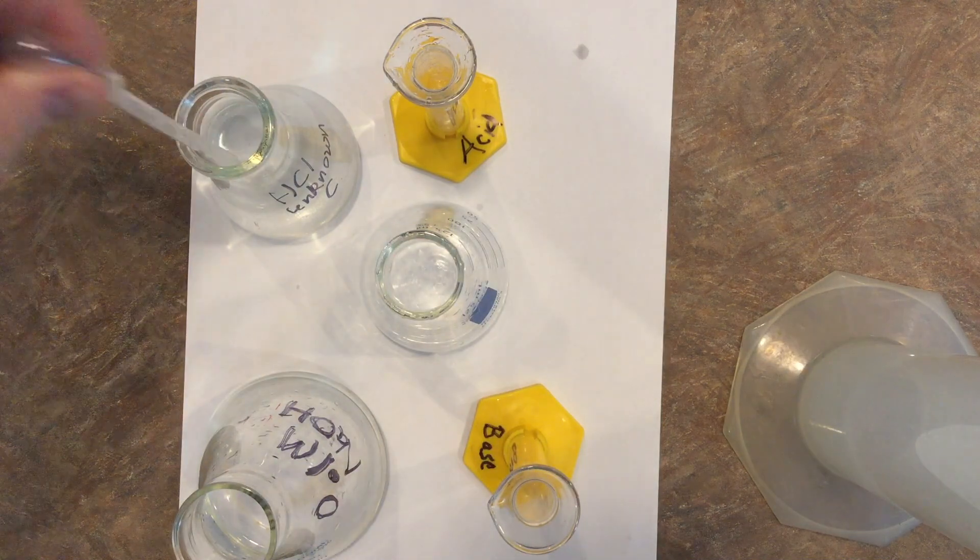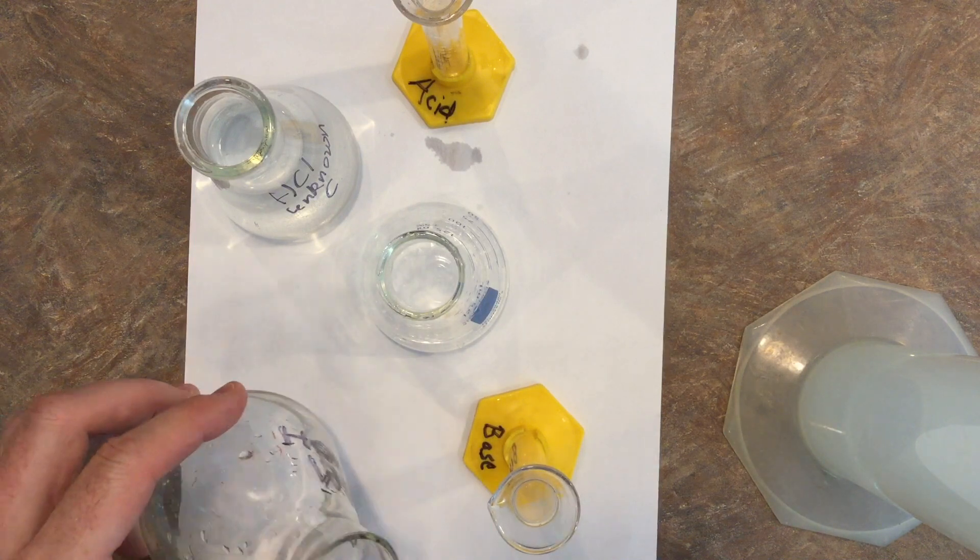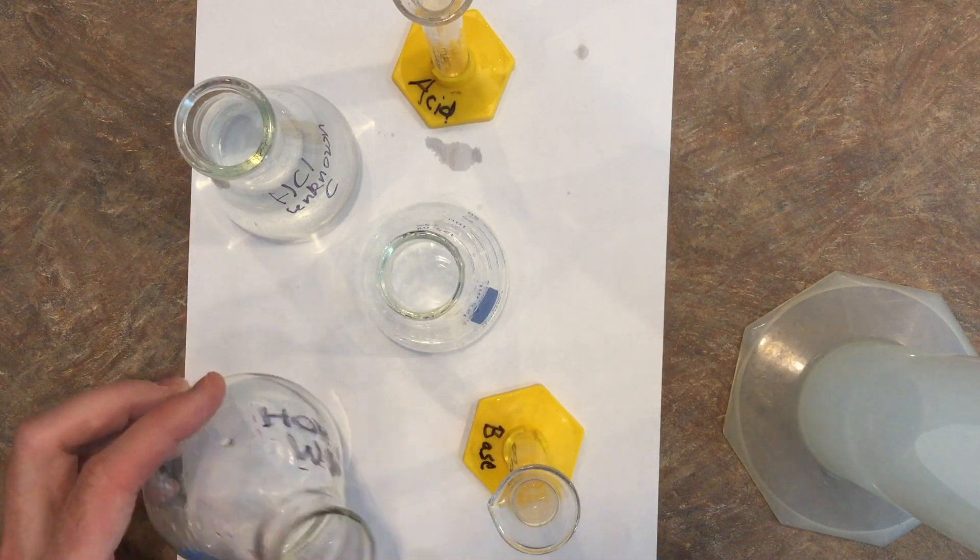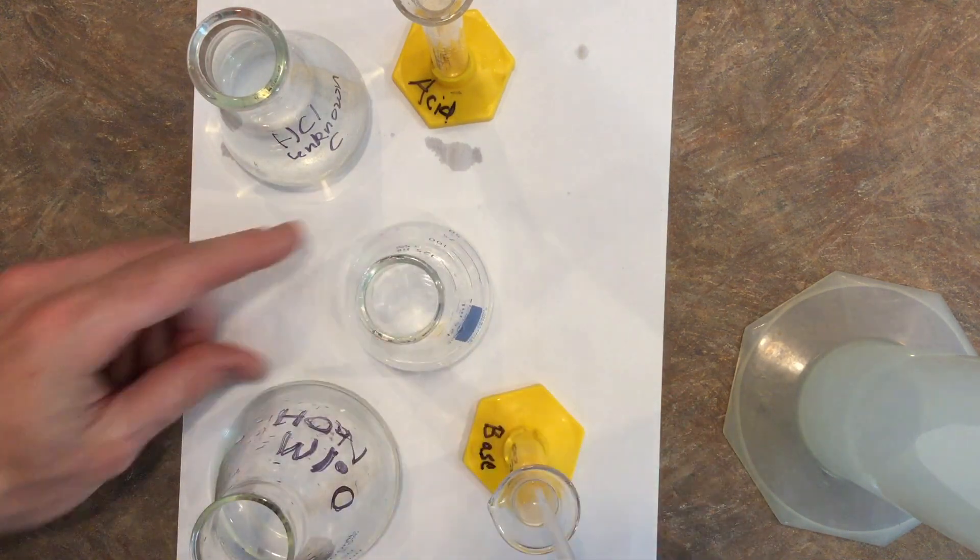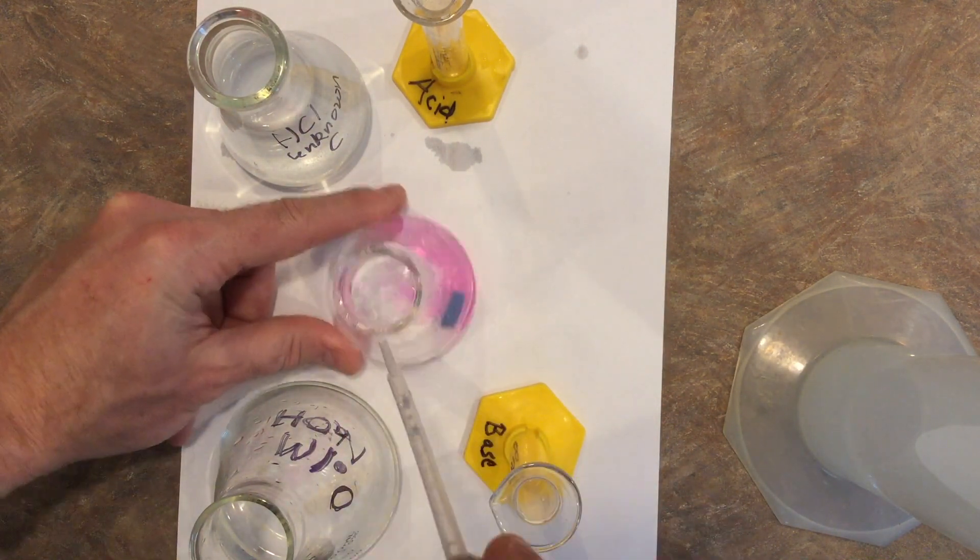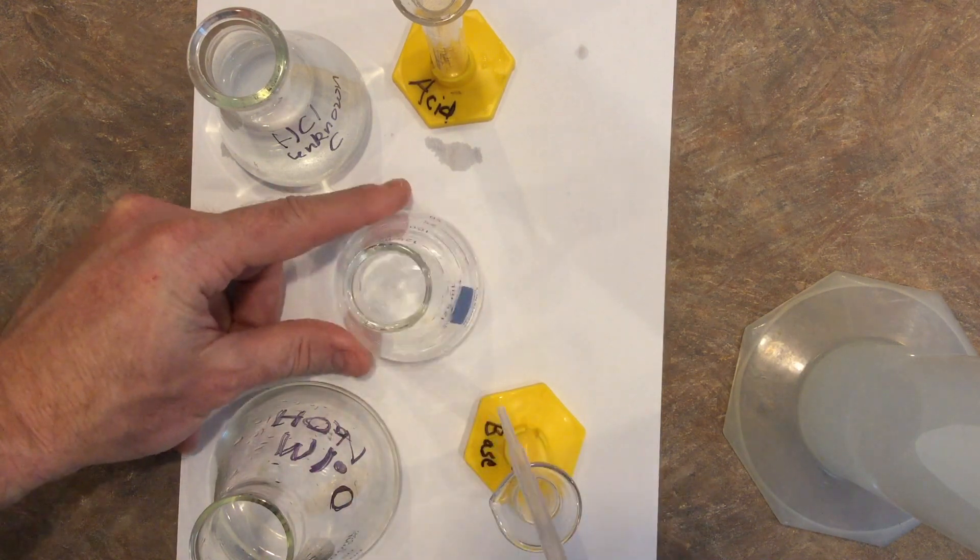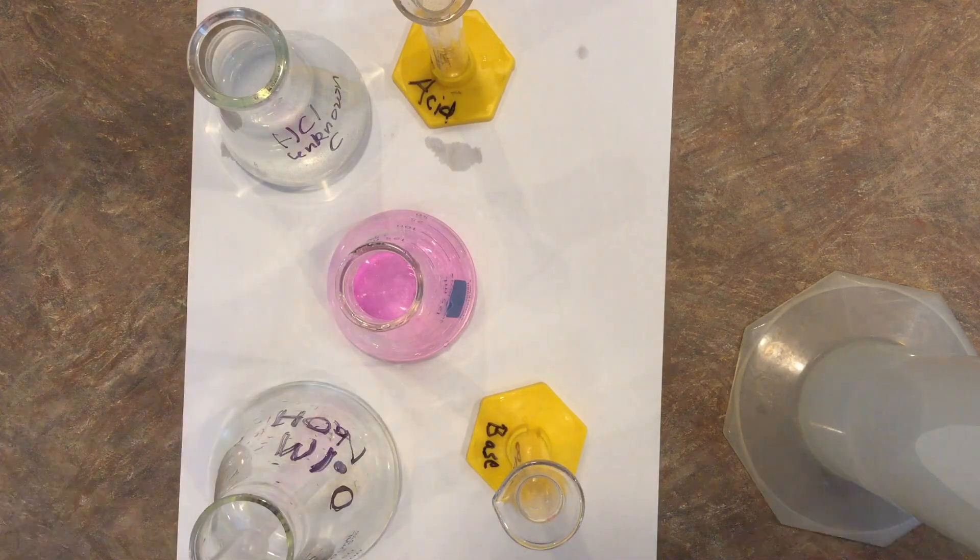And finally we'll go on to unknown C. We'll get 10 milliliters of that into the Erlenmeyer flask. Then we'll get 10 milliliters of our sodium hydroxide and slowly start adding it over.